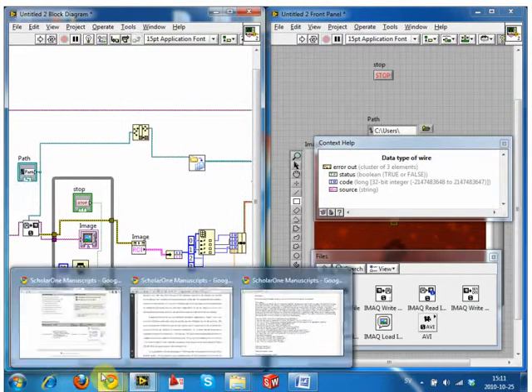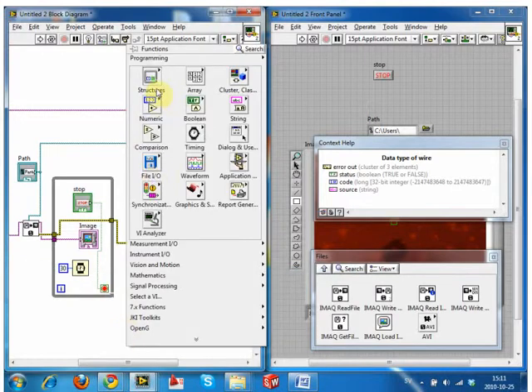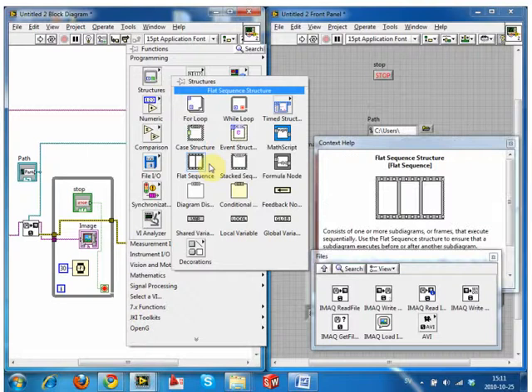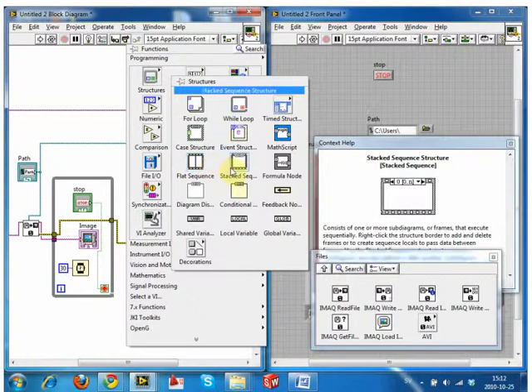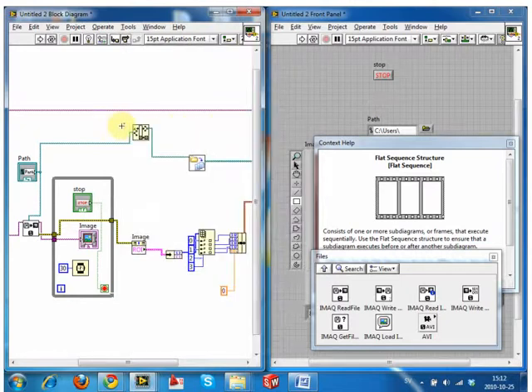Lots of people will use these different structures to do exactly the same thing. You can run flat sequences, which determines an order. You can run stack sequences, which is exactly the same, but rather than being a film strip, it's like pages in a book. You can do all other kinds of things. You can run them into time sequences or ones that wait for particular actions. But by far the easiest way is to just string an error line, because it can't action until that's been finished. So, okay, we've now determined the order. This should run reasonably in order.